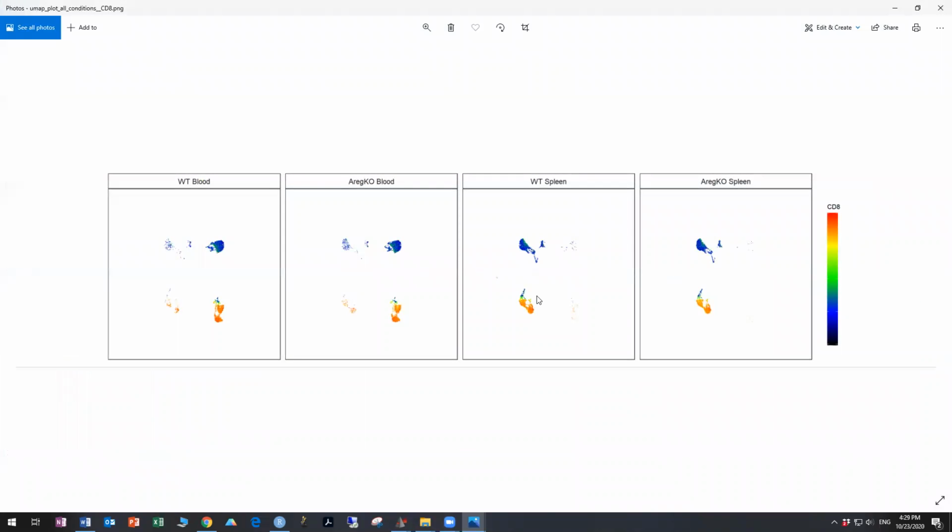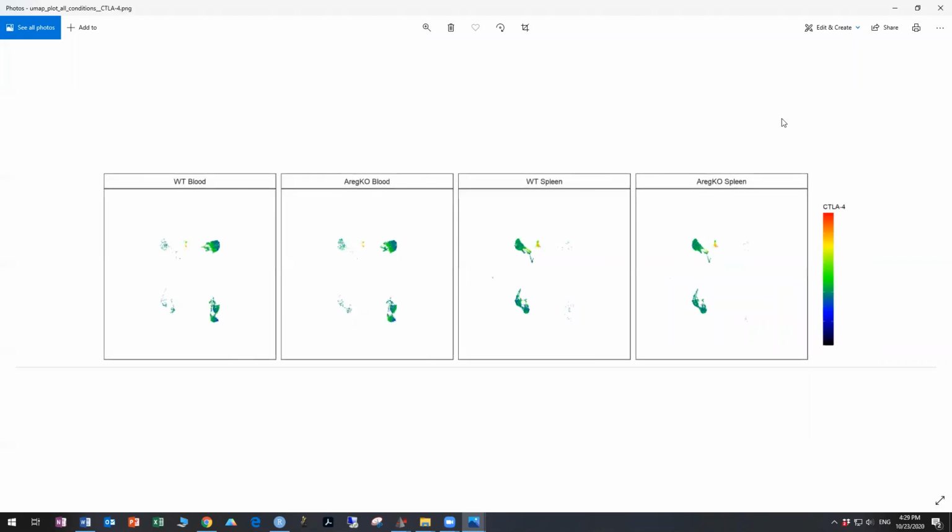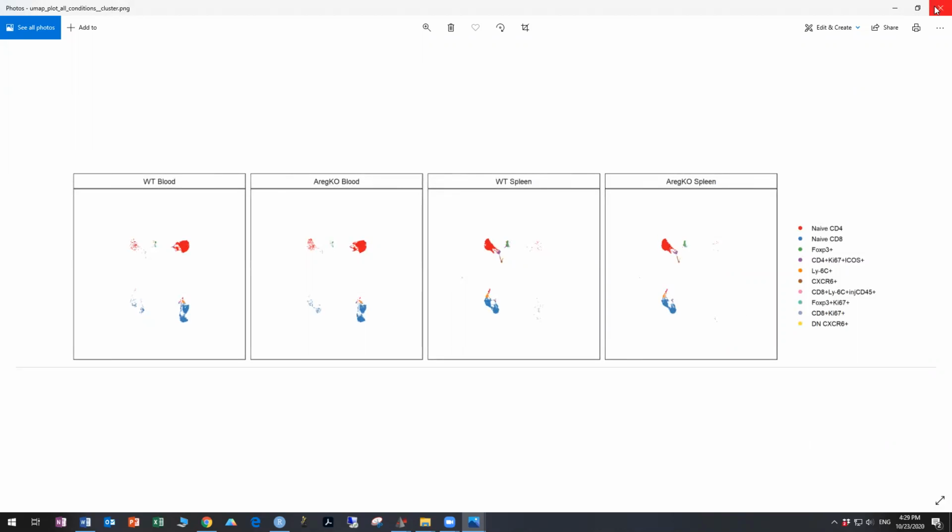And so we can go through and have a look at a couple of these. And it's a different representation of the data. In some cases, you may prefer one or the other. It's more of an aesthetics thing most of the time. Sometimes one of them performs better than the other in putting similar cells together in difficult data sets. This one's pretty simple, so clearly the clusters are quite well separated.